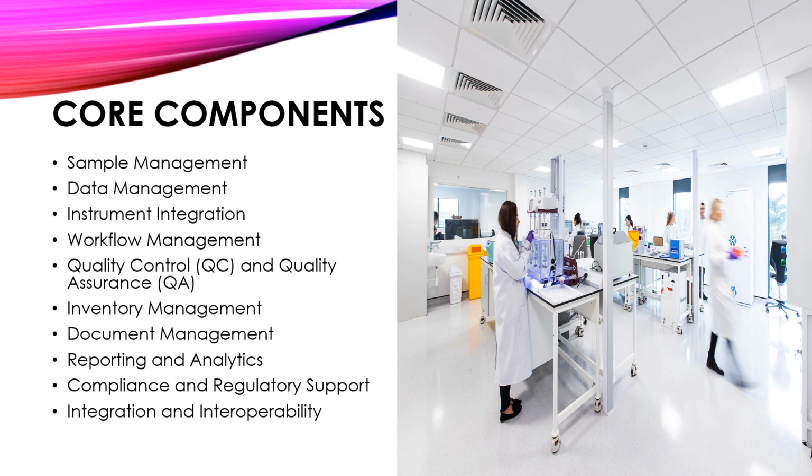Data management. A laboratory management system manages various types of data generated during laboratory processes, including test results, patient information, experimental data, and quality control data. It ensures data integrity, security, and compliance with regulatory standards.